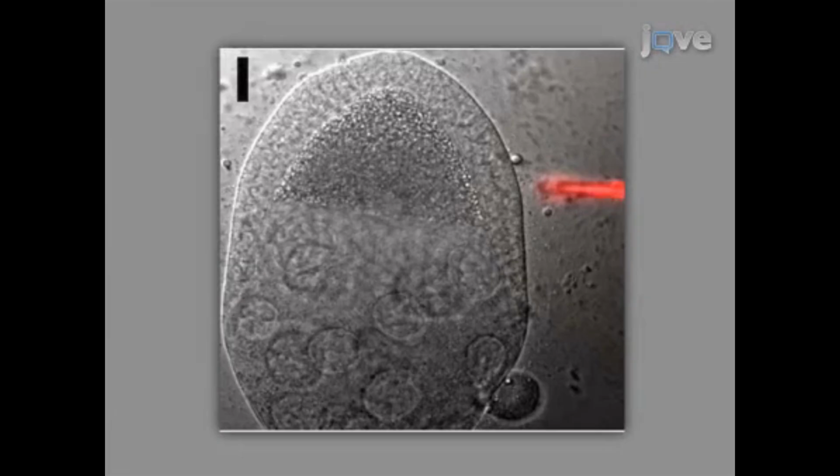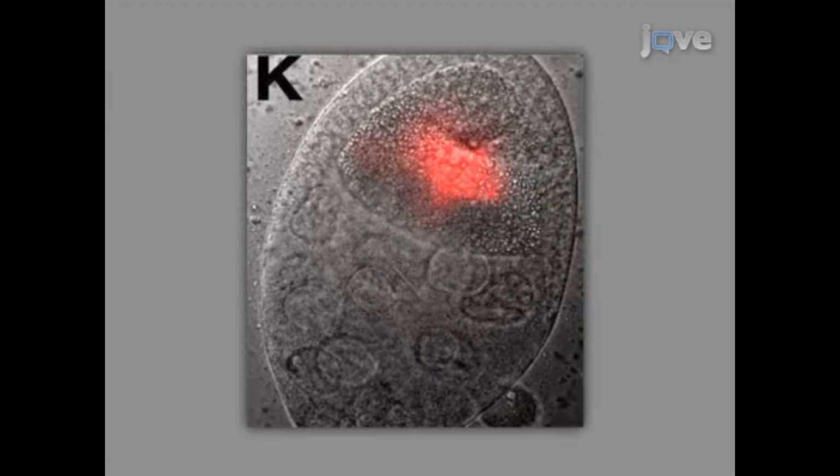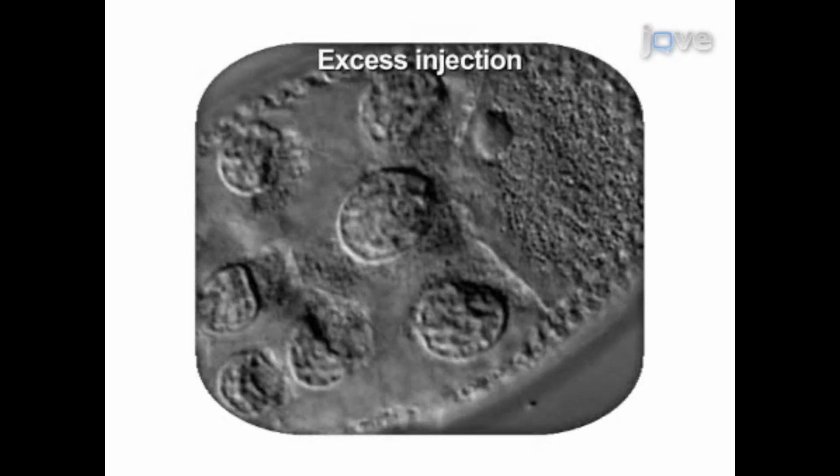Speed is imperative. If an hour or more has elapsed between egg chamber isolation and oocyte injection, the oocytes will be difficult to inject and exhibit phenotypic changes associated with stress. Similar issues can arise with rough handling of the oocyte or injection of excess volumes.